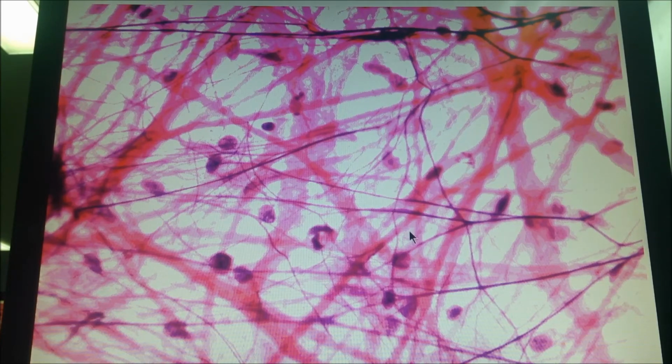الmesentery is very thin. Histologically we can use it how? You take the membrane in a specimen from an animal. You directly spread it. There is no need for sectioning, there is no need for anything. It is very thin, the light can pass through it easily. You directly spread it on the glass slide and you stain it and you will see this. So this is a mesentery, we call this technique a spread section, direct spread section for the mesentery.